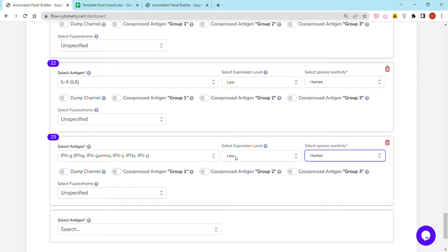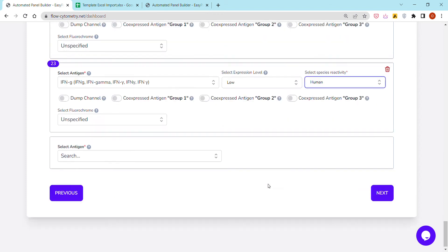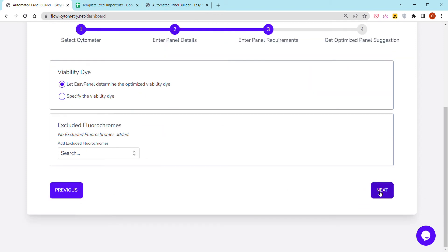I've explained these in my previous video, and they impact the panel design. There is a small question mark that explains what these options are and how exactly they impact the panel design. I'm going to click next. It's asking us here about the viability dye.